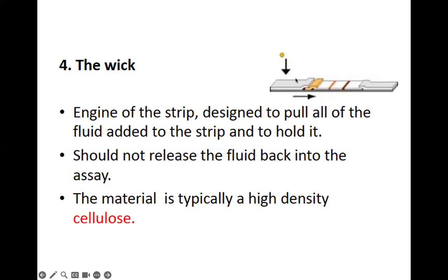Okay, so be careful. You have to optimize the amount of buffer so that it can move properly towards the end. But at the same time, you maintain a suitable amount of antigen inside the sample to be detected by the capture antibody. So those are things that you have to be careful about and do a lot of optimization until you get the formulation. All right.